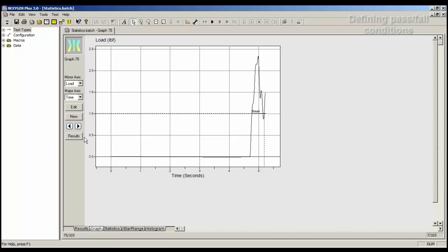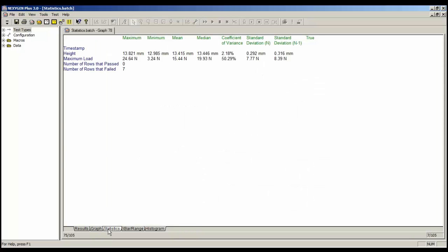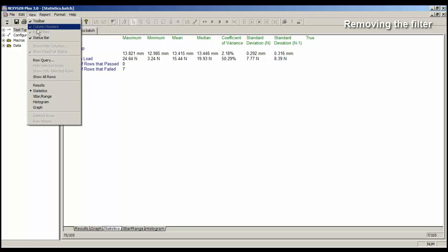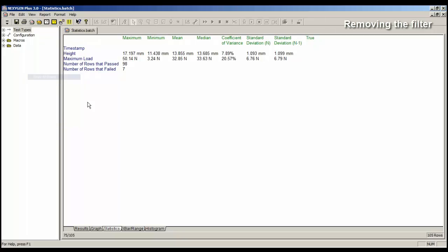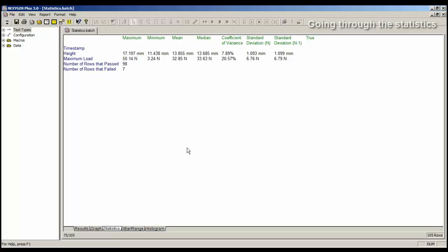Let's look again at these statistics. So we'll click on the Statistics tab. We want to view the statistics for all of the tests, so we need to remove the filter, and we do that by going view, show all rows. Now we know that all the failures did have low values of maximum load, and if we look at the minimum value, maximum load, it's actually 3.24 Newtons. It's showing me here that we've got 98 good tests and 7 failures.